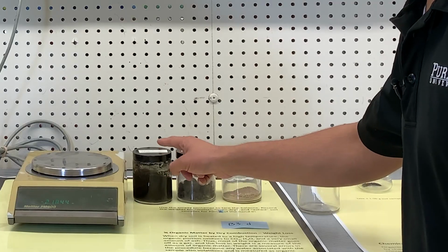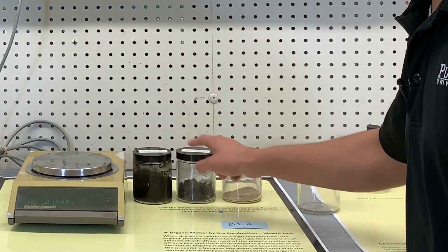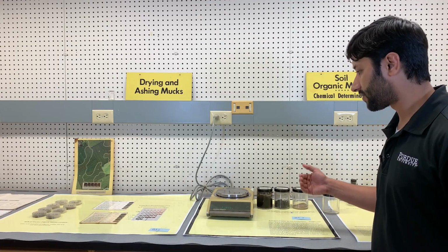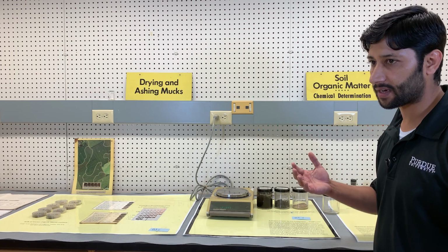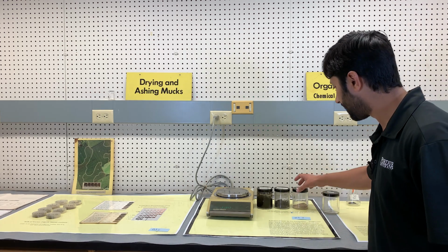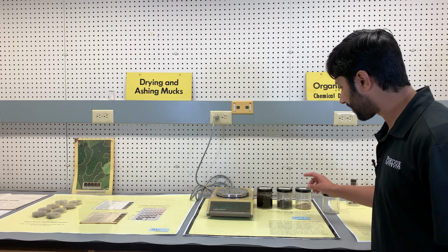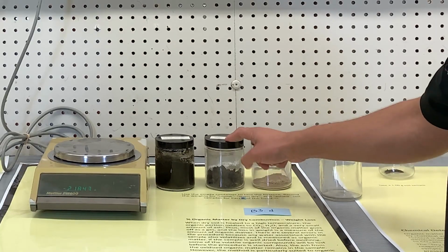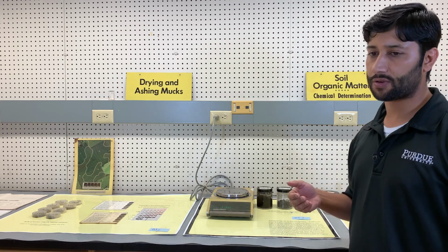If you subtract the oven dry soil from the field moist soil and then divide it by the oven dry soil, you will get the amount of water in the soil, and you will be surprised that it has a lot of water in this one because it has a high amount of organic matter. And then if you want to find the amount of organic matter, you subtract the ash weight from the oven dry soil and then divide it by the oven dry soil, and that's how you determine the amount of organic matter.